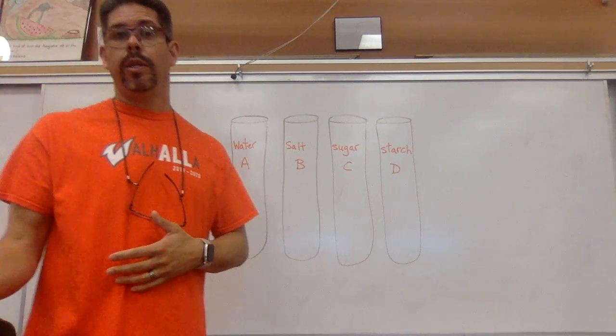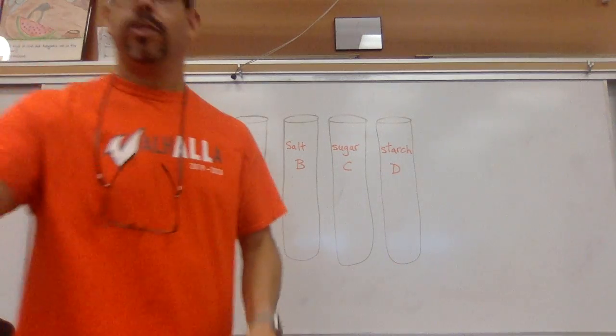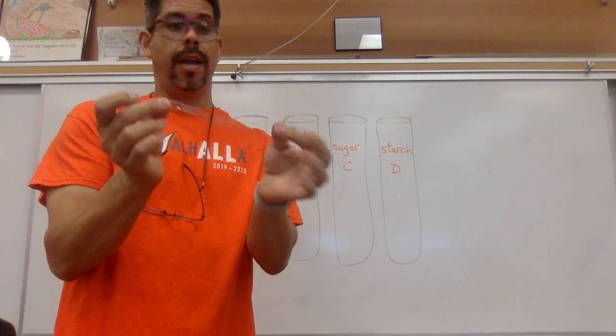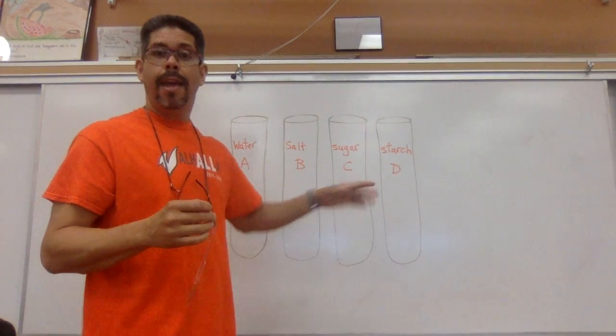Now, there are different chemicals we can use to test for proteins and for simple sugars, right? Now, notice, this is interesting, right? Starch is made of simple sugars, monomers of monosaccharides, right? But yet we put sugar and it didn't react, right? One of the test tubes, test tube C, had sugar, and it didn't react.